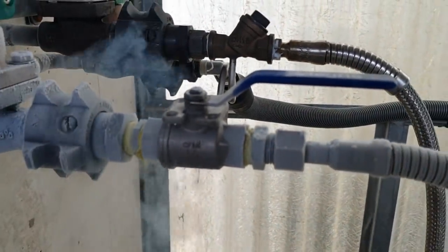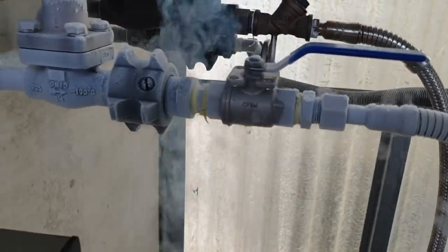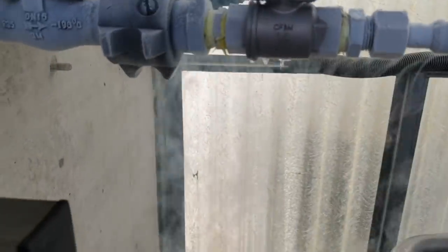And that shouldn't be like that. That's a leaky joint. That's liquid nitrogen coming out of there.